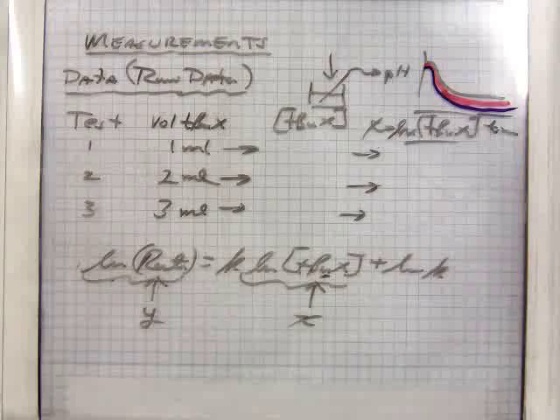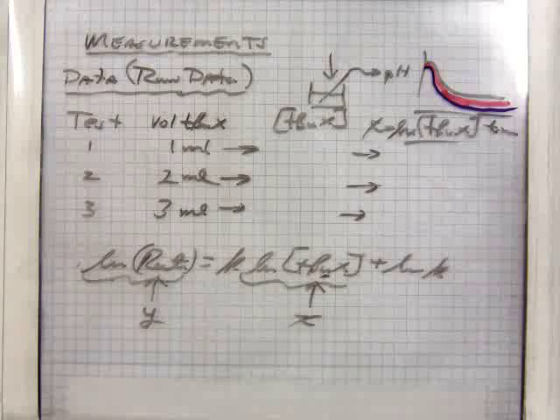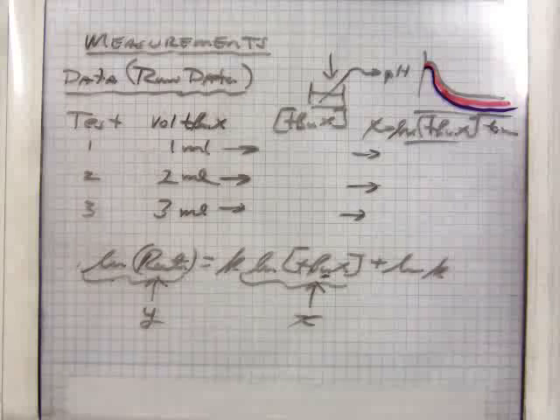So what you'll do, after you generate these three curves, is put the interpolation line in and slide it along, and it'll tell you what the time is in the box. This one shows 100 seconds. The 1 mil injection was 2.588. The 2 mil injection was 2.358, and then we have a 2.258. Now, you increase concentration, you decrease pH. That means more acid is generated.